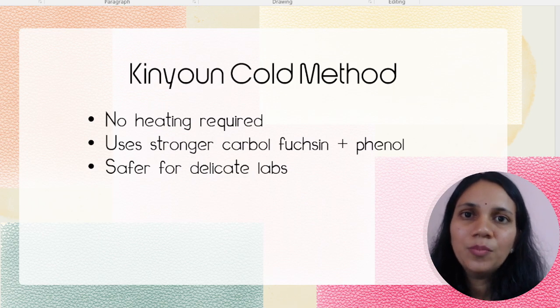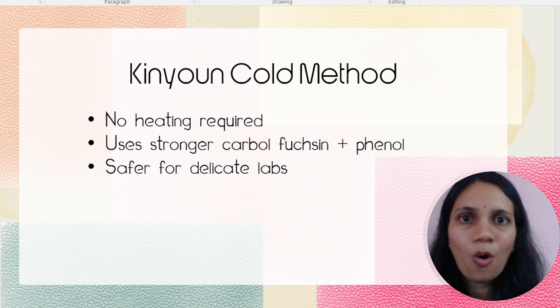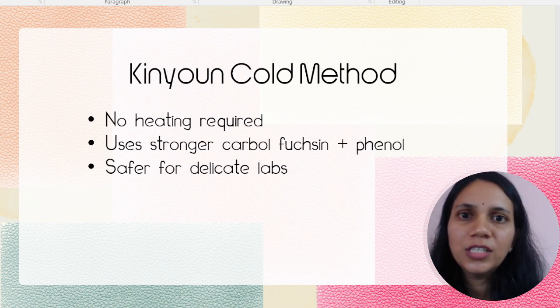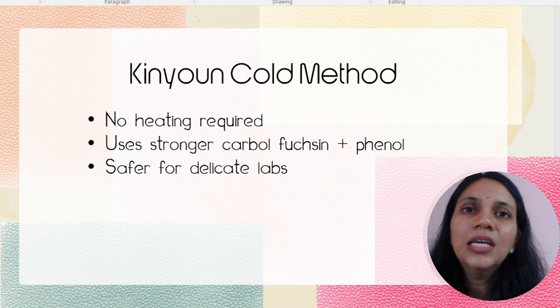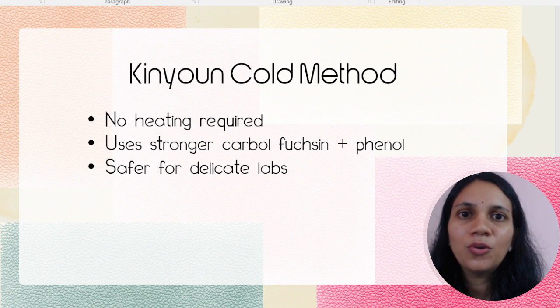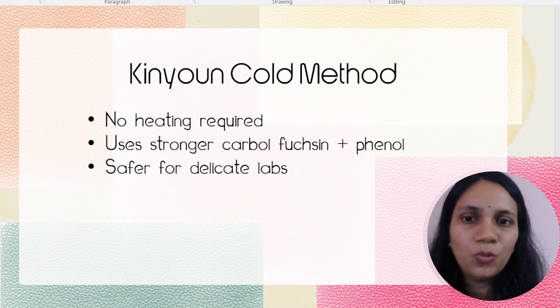So the Ziehl-Neelsen method is a hot preparation or hot method. There is yet another variation of this method that is called the Kinyoun method or the cold method. So here everything remains the same. Only thing, we are not going to use any sort of heat over here.